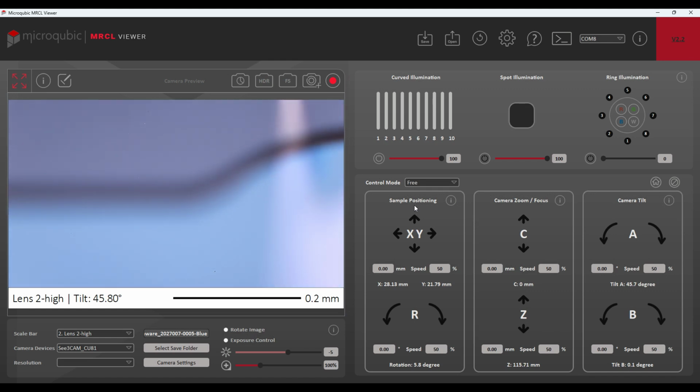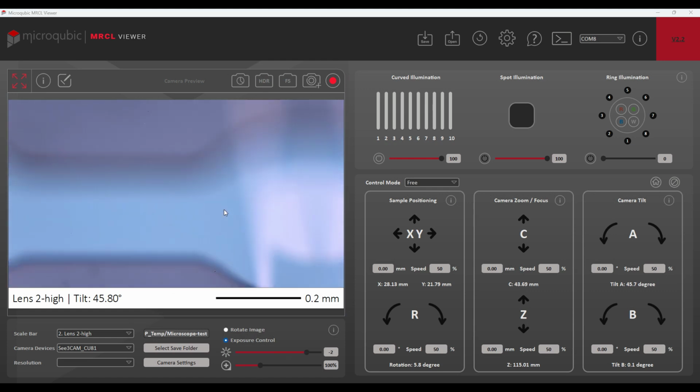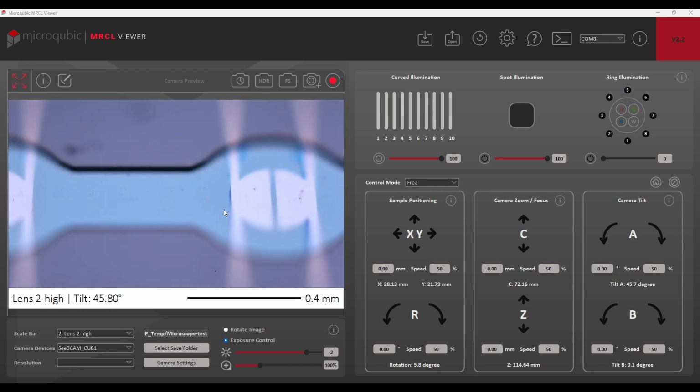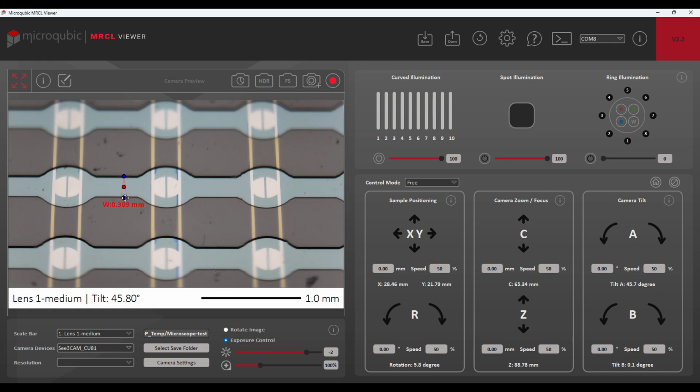Here, we have a photoresist channel that was previously measured at 15 micrometers using a stylus profilometer. We will align the 3D height annotation to the midpoint, where the interface with the silicium surface can barely be seen as a thin line. As in the previous example, you can use the width annotation to measure the channel's width in this tilted view. Please always remember that measurements are accurate only in focused regions and depend on the accuracy of your calibration data. Regarding focusing, I want to mention that the software does not yet support live measurements after focus stacking.